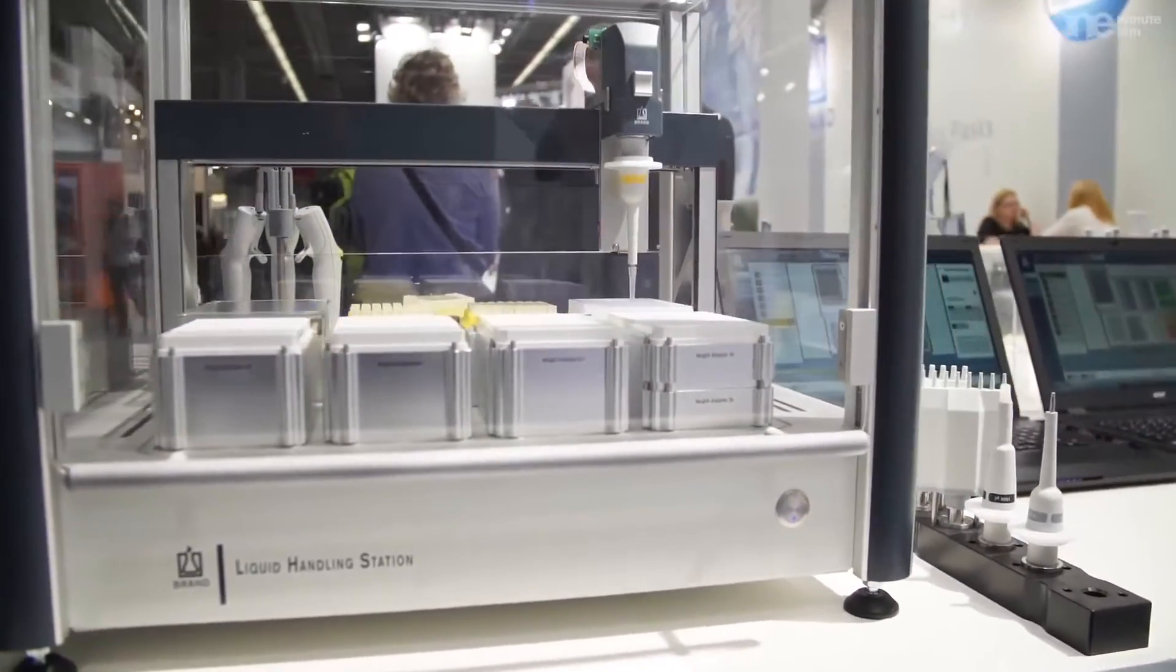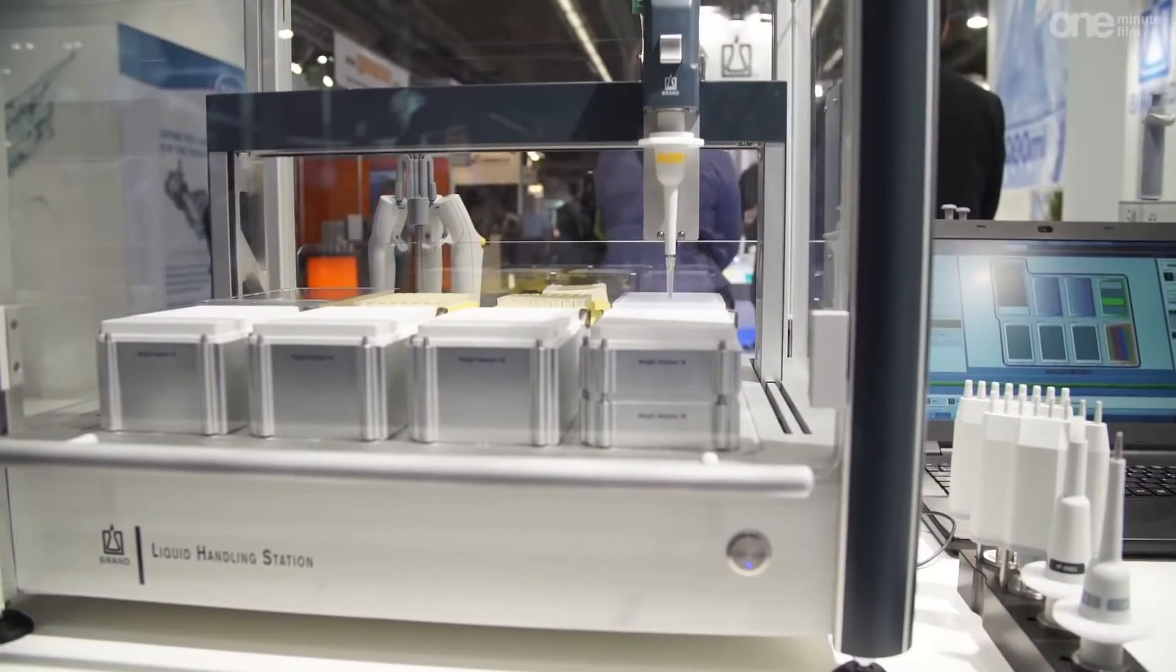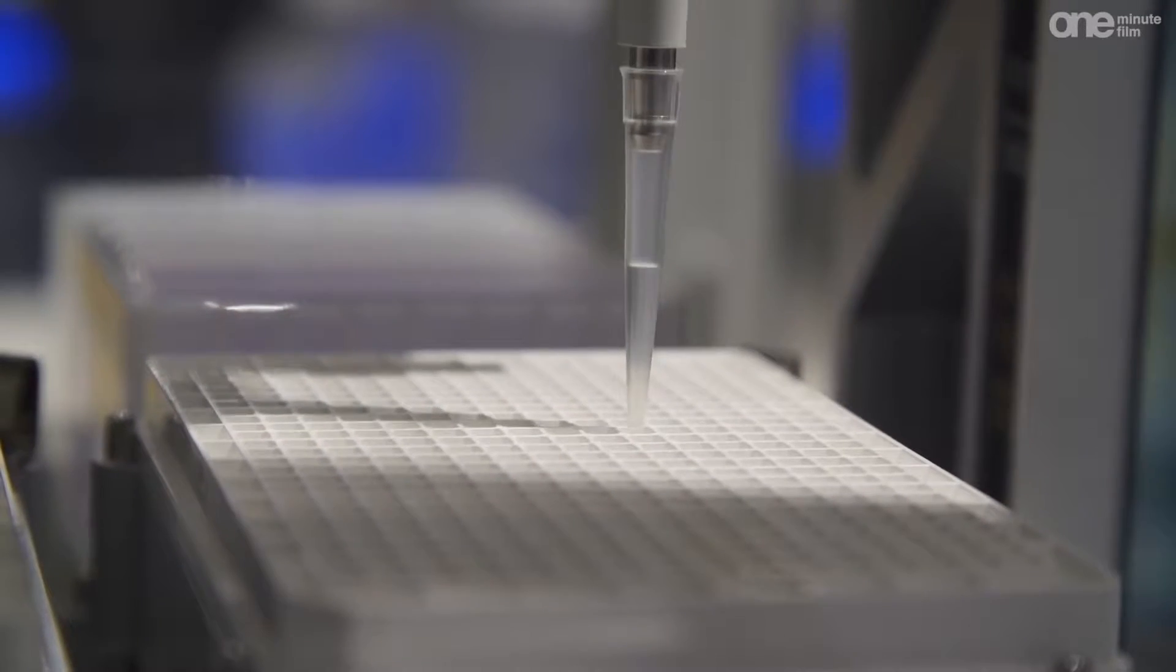The BRAND liquid handling station is a pipetting robot for moving liquids in the volume range of 1 microliter to 1 milliliter.